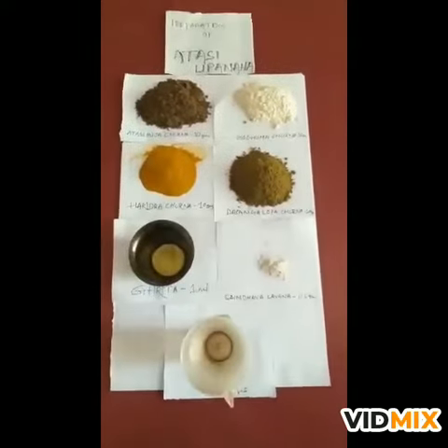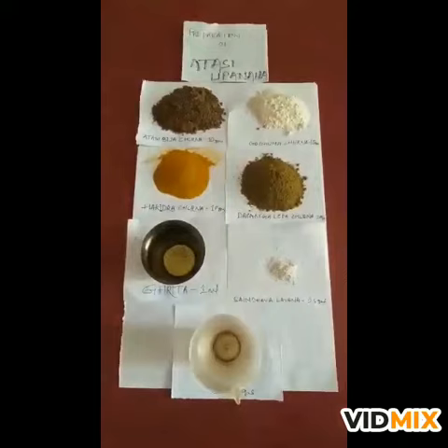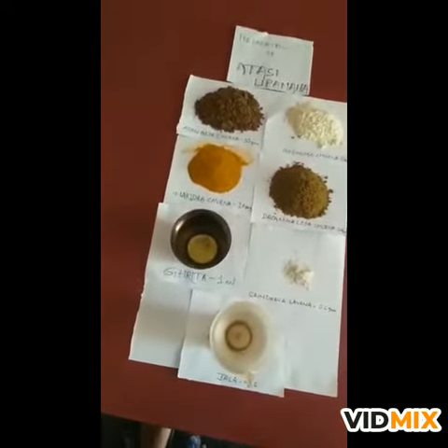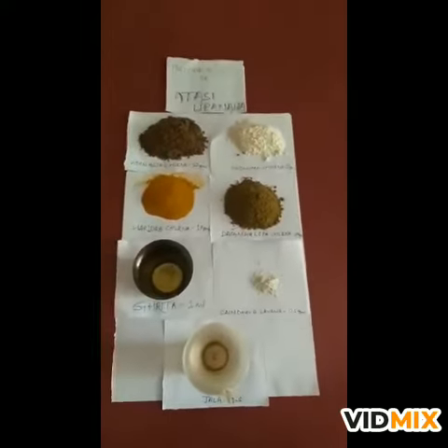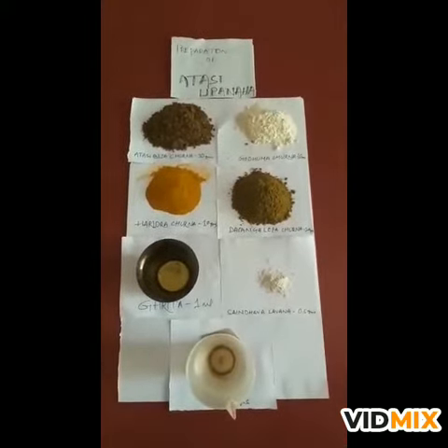Here we took atasi bija churna 10 grams, godhuma churna 10 grams, harindra churna 10 grams, dasangalepa churna 10 grams, grita 1 ml, saindhava labana 0.5 grams, and jala according to required quantity, about 60 ml.